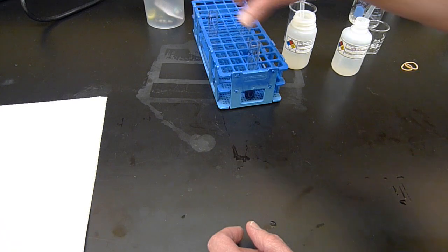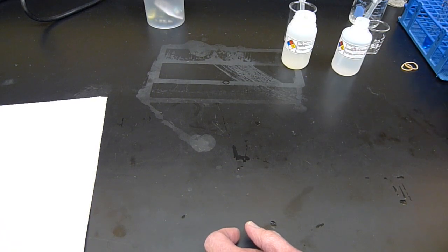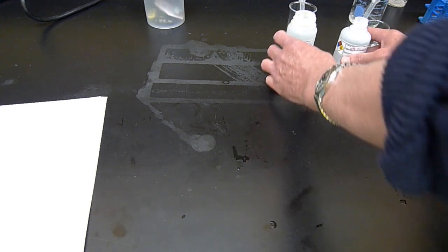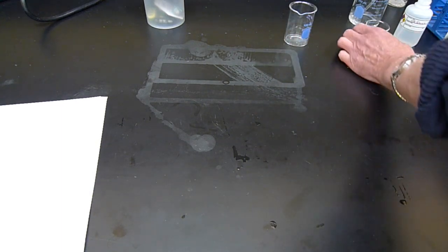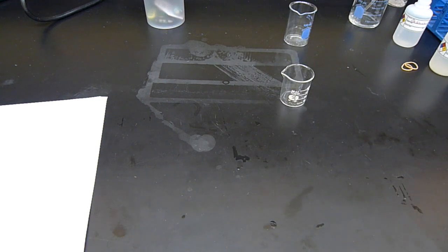If there's some sugar present, it could turn greenish, yellow, or orangey depending on how much sugar is in there. If there's a little bit of sugar, it will turn green. If there's a lot more, it will turn yellow. If there's a significant amount, it could turn orange or even red. So that's how we're going to analyze for the sugar too. In this beaker here, I'm going to put some distilled water.